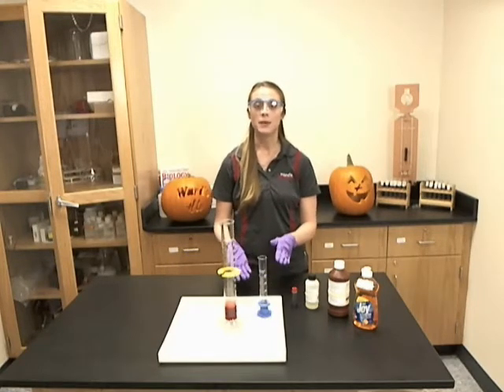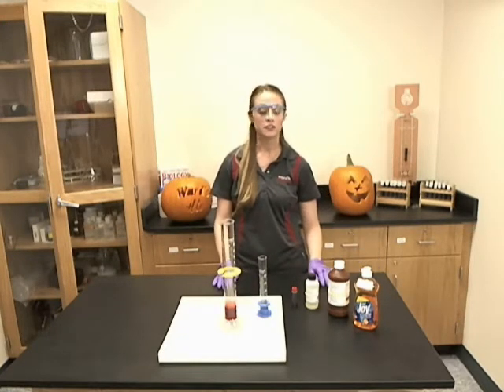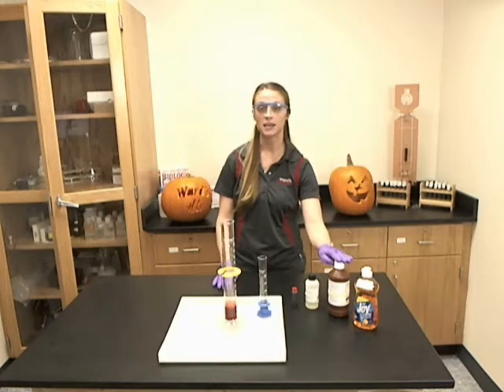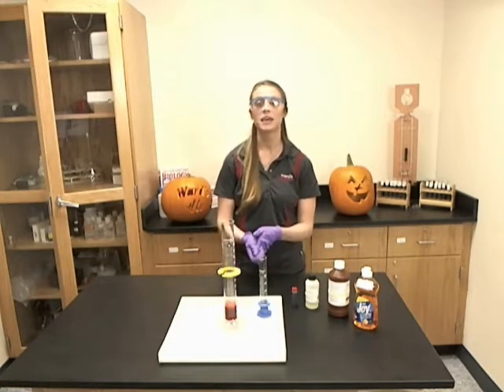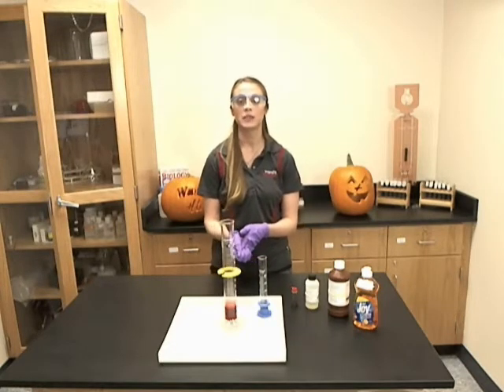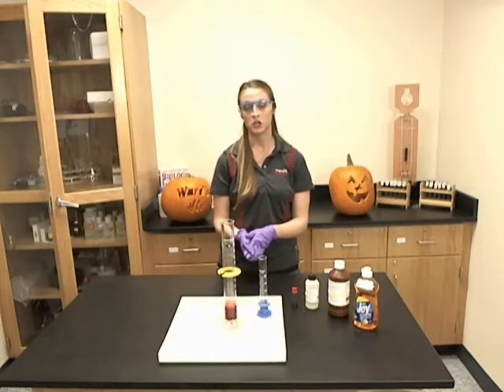To begin, mix 5 to 10 mils of the dishwashing detergent and 35 mils of the hydrogen peroxide. You can also add some food coloring to make it more colorful and fun. Mix this solution with a glass stirring rod and then add it to a large graduated cylinder or the Wards demonstration tube.